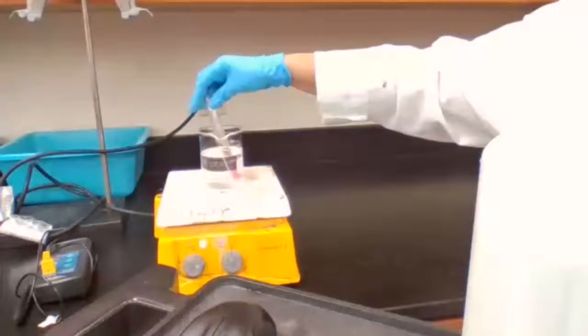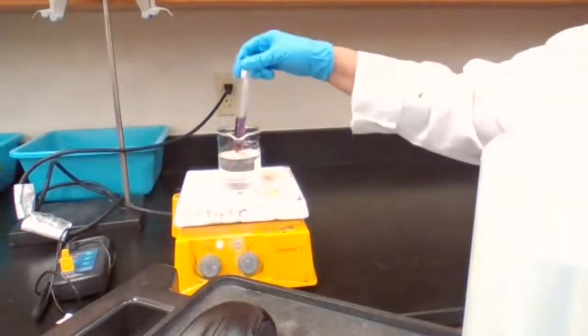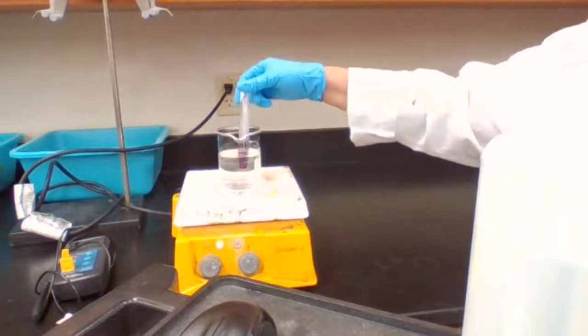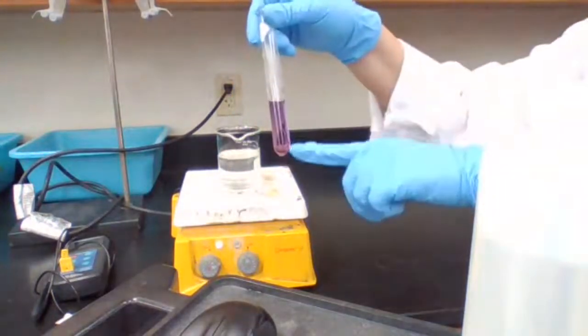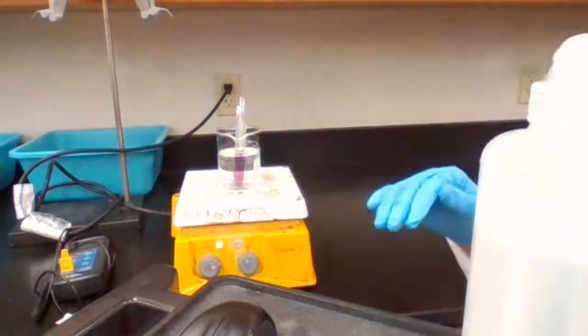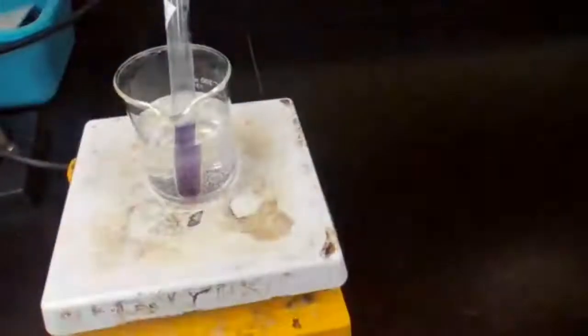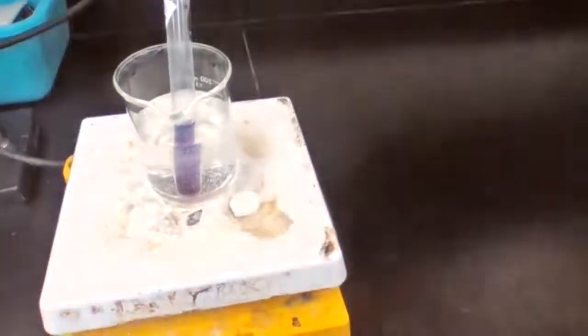Okay, I want you to see that there is a change in color happening in the test tube. Gradually, you see the top portion is blue, the bottom still is pink, but we are going to continue until no more color change is happening. So I'm going to bring the camera closer so you could see the color change. Color change is taking place in the test tube.